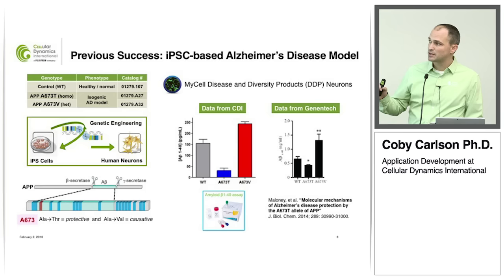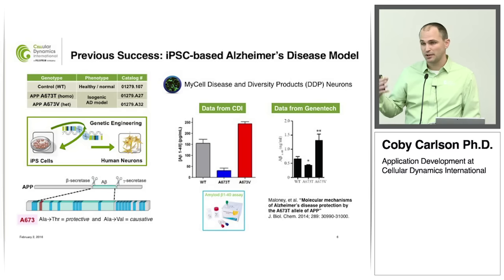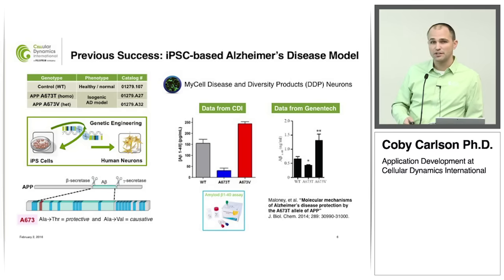We can make 3 different iPS lines from those 3 lines. We differentiate to neurons using the exact same protocol, and at the end of that, testing these 3 different neurons in a dish, we try to quantify the amount of A-beta protein, the peptide, that was released. So, the mutations that are introduced for this APP modify the processing of amyloid precursor protein, and then the fragments, the peptides that come out of it.